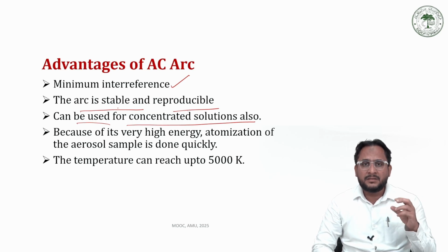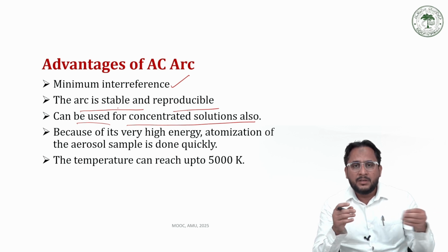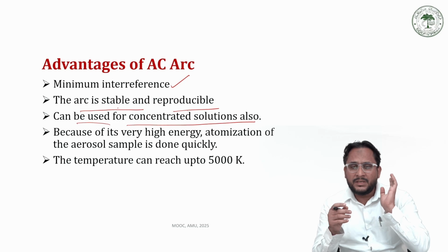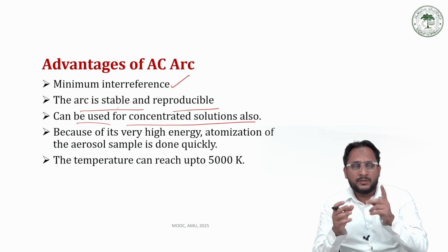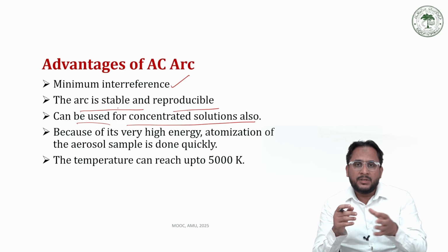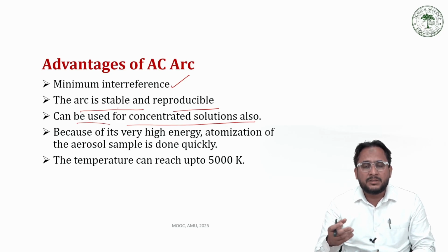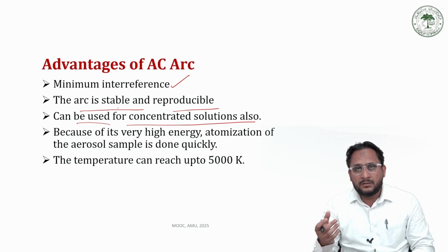Therefore, we use a capacitor that transforms all the energy stored in the capacitor to this AC spark once at a time, so that the capacitor can transform all the energy stored in it to the AC spark once. While in case of AC arc, the discharge should be for a longer period, so we need a continuous supply.